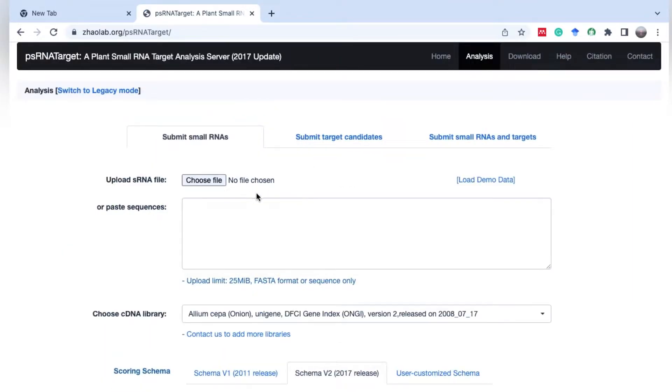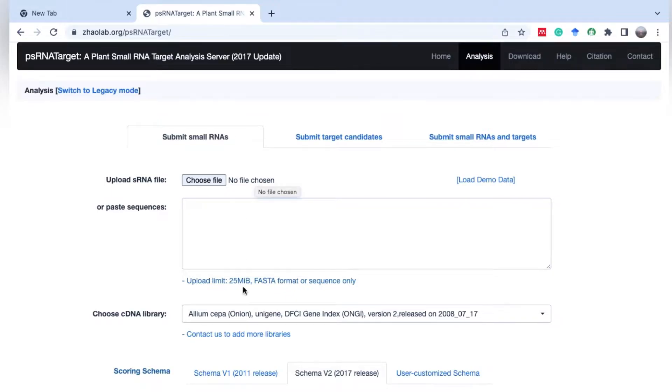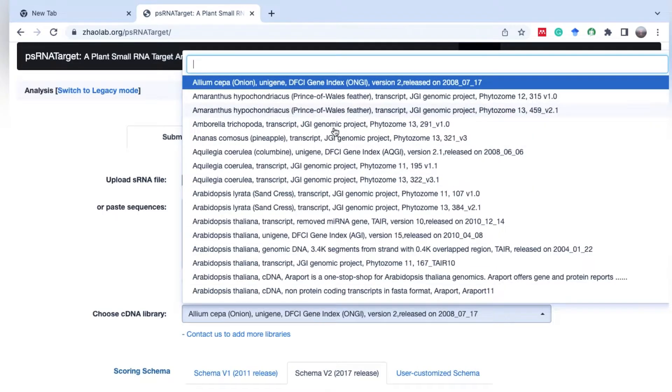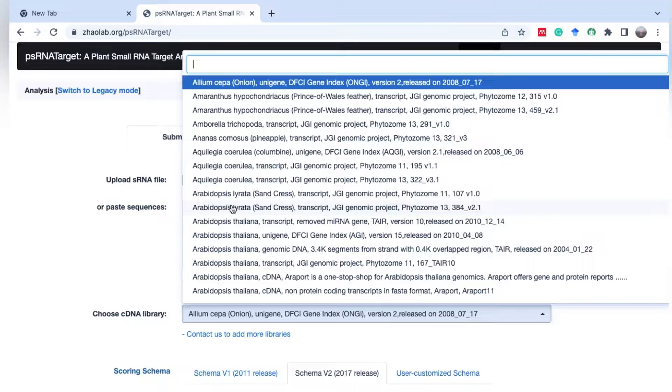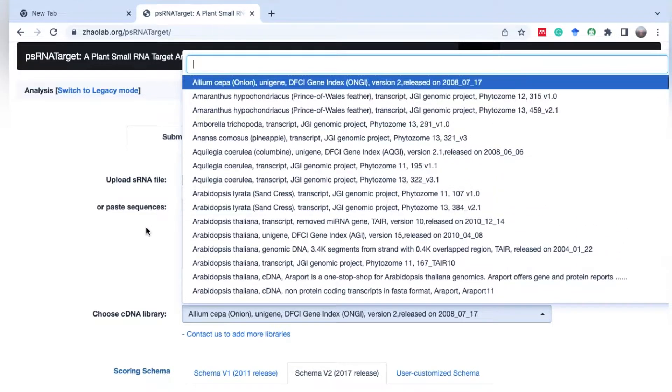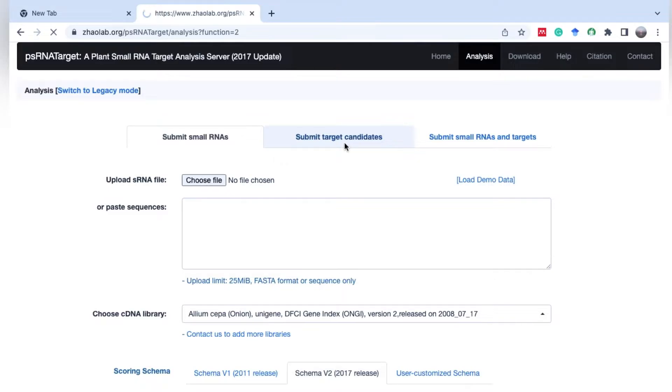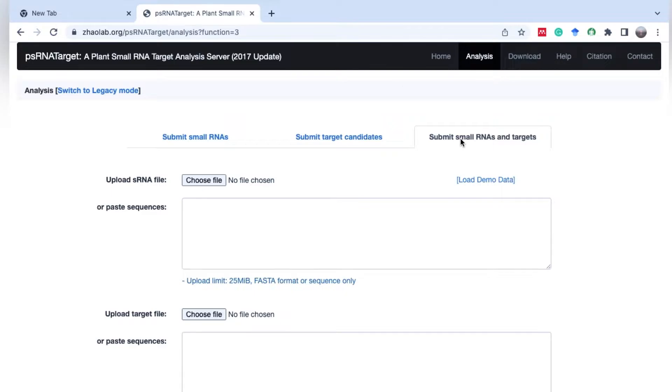This tool has three options for target prediction. First, submit small RNA - here you can submit your small RNA and find the target in different libraries from different plants like Amaranthus, Arabidopsis thaliana, and several others. In the second option, you can submit targets of microRNA and find what microRNAs are involved in the regulation of these target genes. In the third option, you can submit your own microRNA as well as target, allowing you to predict targets of miRNA in your own data or library.